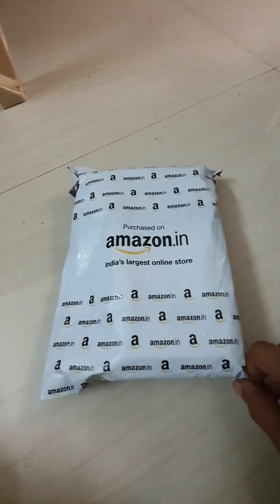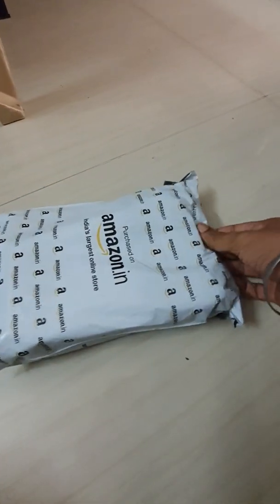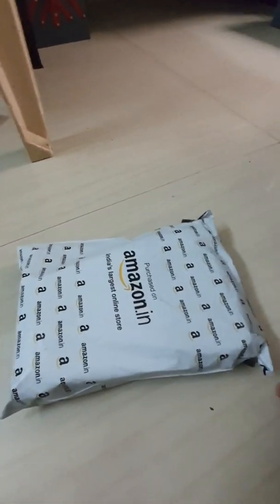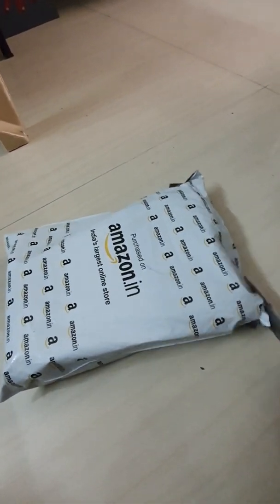Today being the last day of the year, this is the last review and my last purchase of the year. Hope we all have a better year starting tomorrow. So let's unbox it — it just arrived, so I'll cut it open.